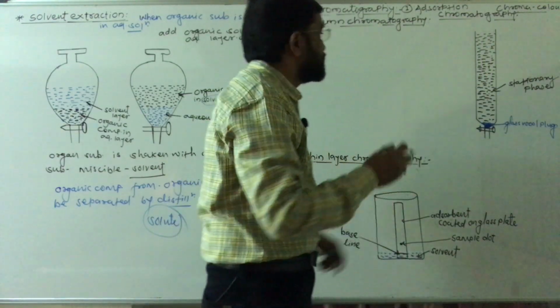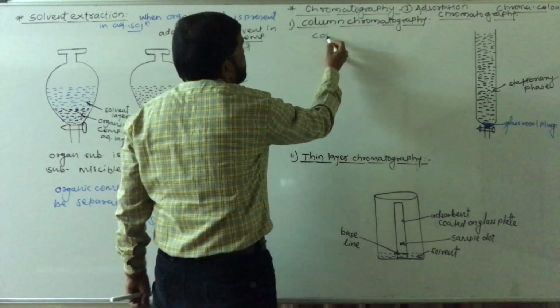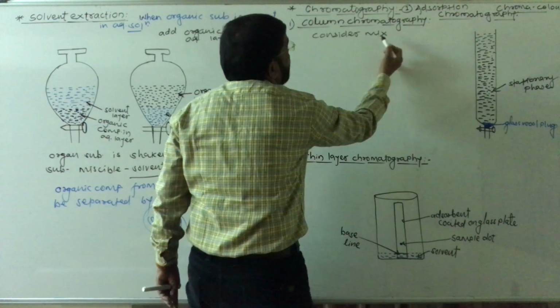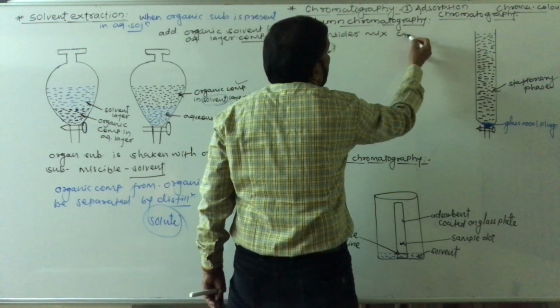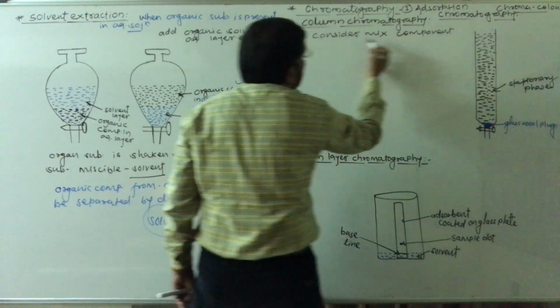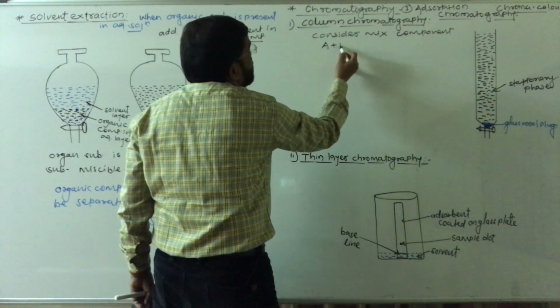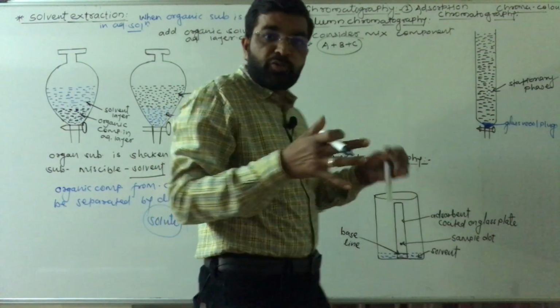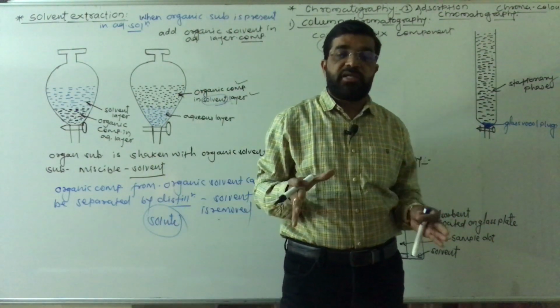Now, suppose you consider a mixture of components, that is A plus B plus C, which we have to separate by this technique.